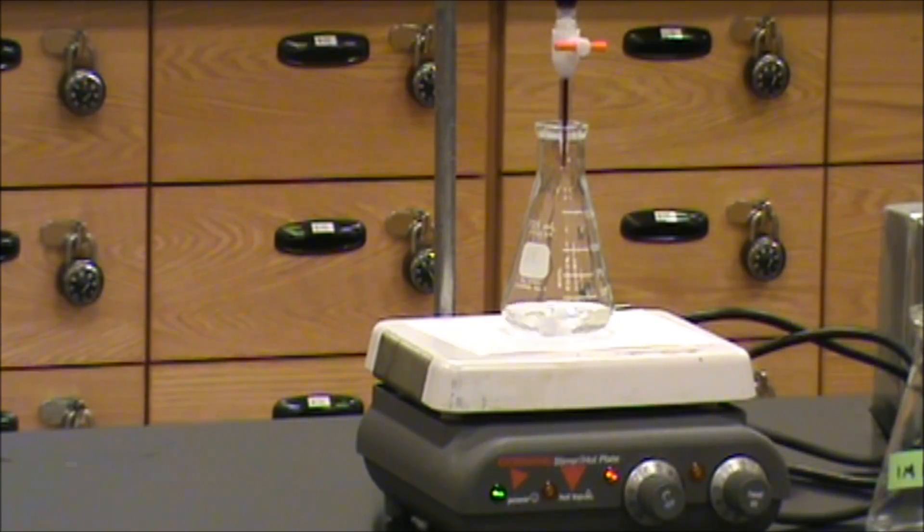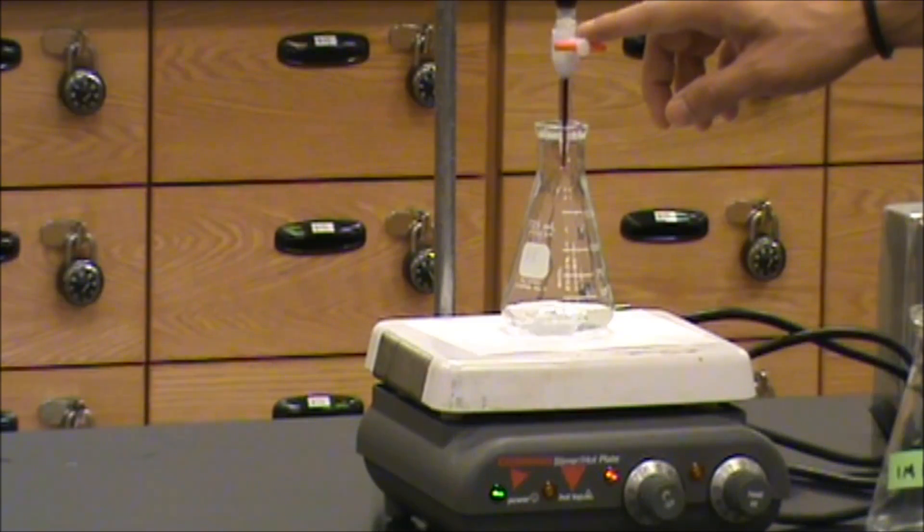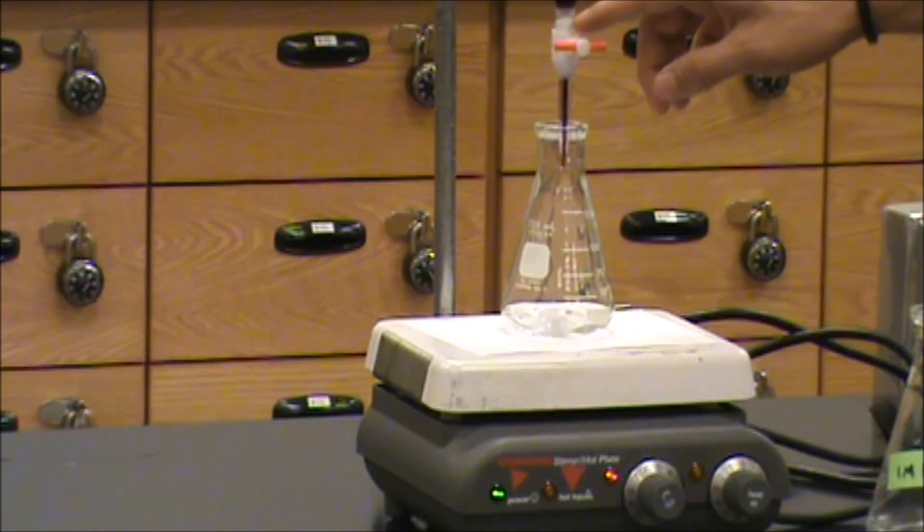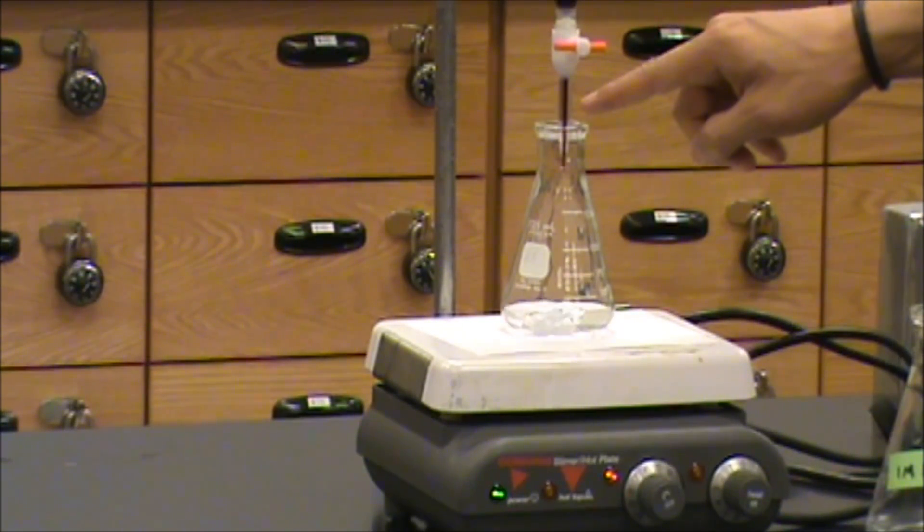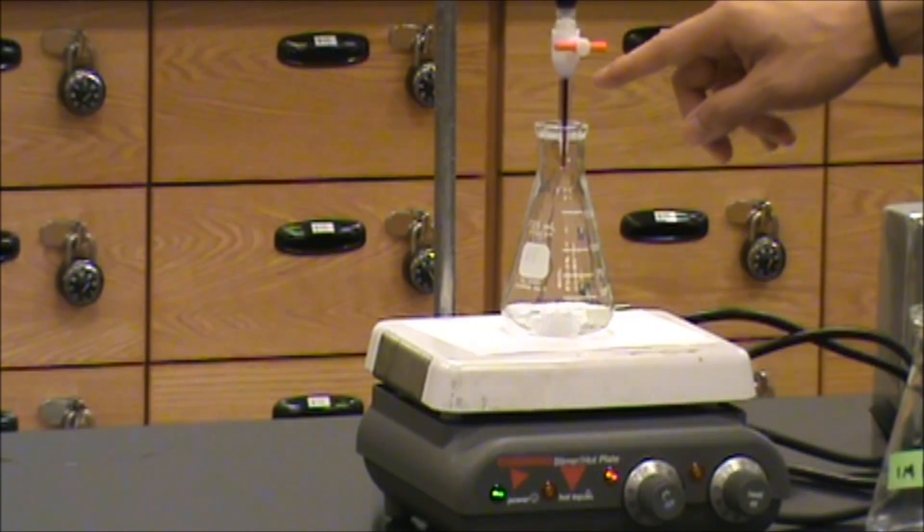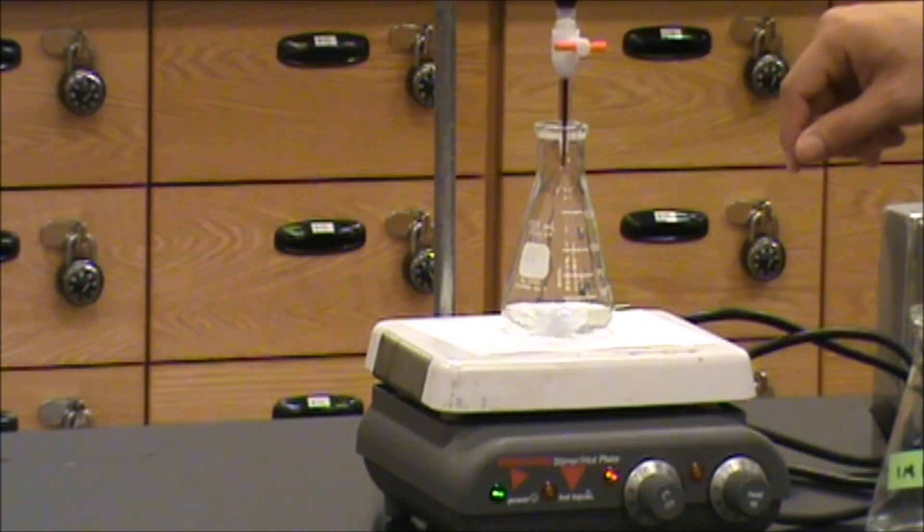It's important to note that a big difference between this redox titration and the acid-base titration is that there's no indicator necessary. The reason for that is that our titrant has an intense purple color. We'll be able to tell the progress of the reaction by observing this purple color.